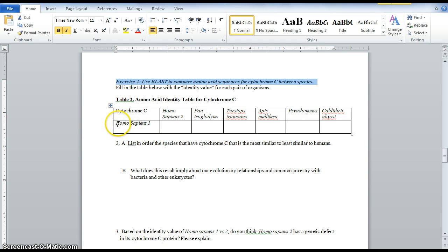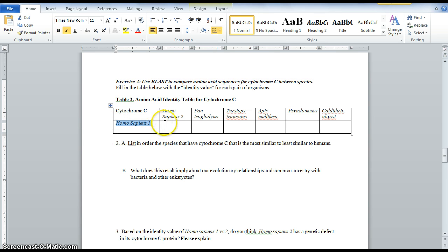What we're going to look at here is our first Homo sapiens, individual number one, and compare that to all of the other individuals here.